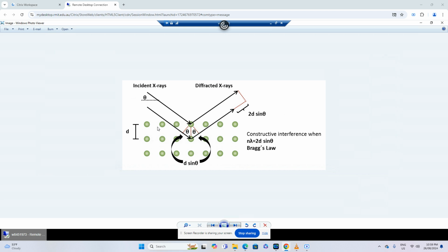These atoms can be from different elements or different compounds that can be formed in the sample, and when the incident rays interact with or illuminate these atoms, they will diffract at certain angles. By moving the tube or the sample and the detector to change the diffraction angle, this XRD machine will measure the intensity of the diffracted X-rays and also the angle between the incident ray and the diffracted X-rays. In this case, the diffraction data will be recorded.